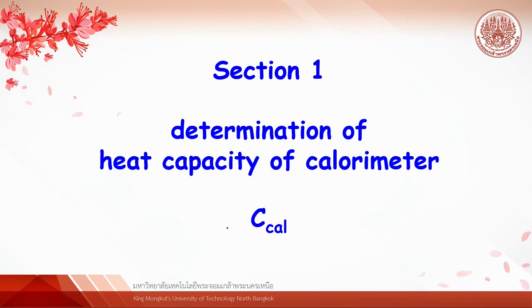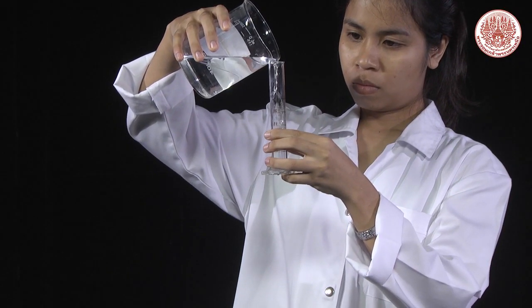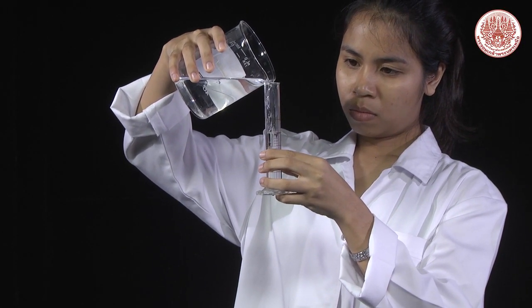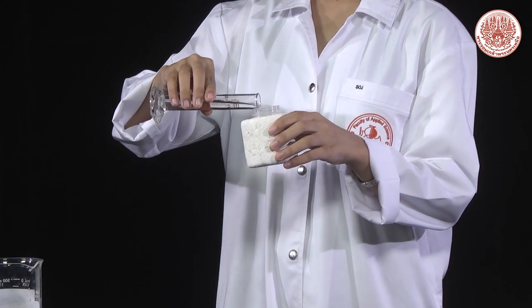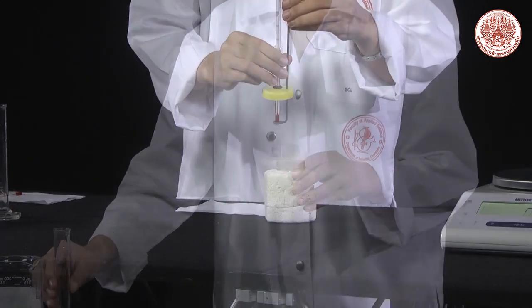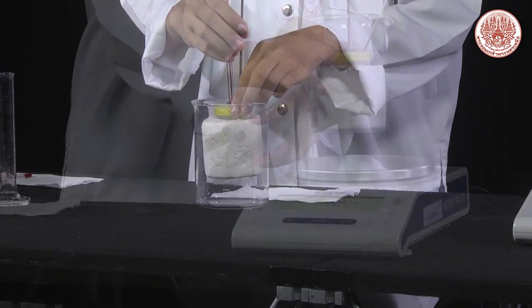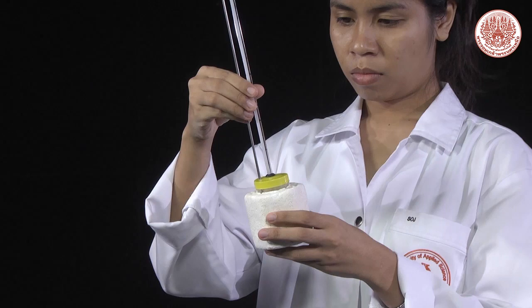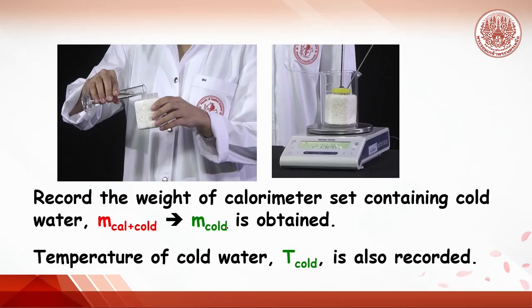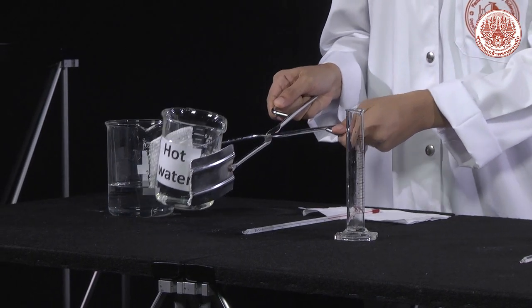Section 1 — Determination of heat capacity of calorimeter. Get 25 ml of tap water as cold water using a graduated cylinder and pour it into the calorimeter, then weigh the calorimeter containing cold water. Also record the temperature of the cold water. Now we have the weight of cold water and the temperature of cold water.